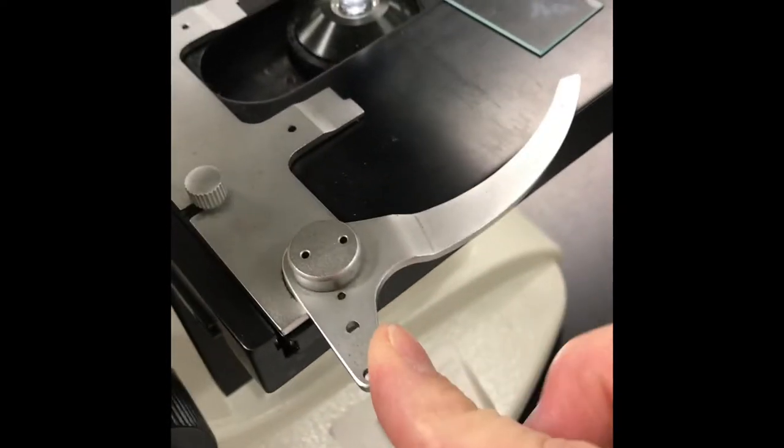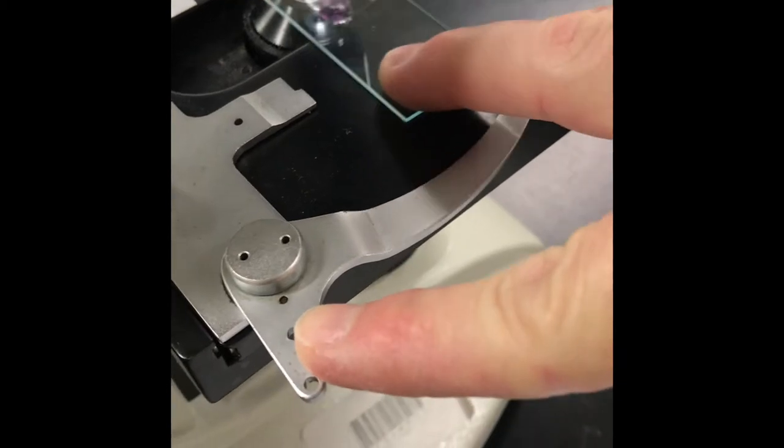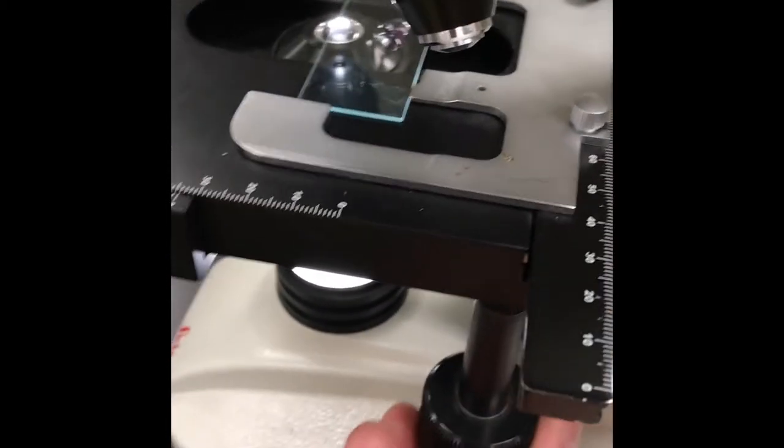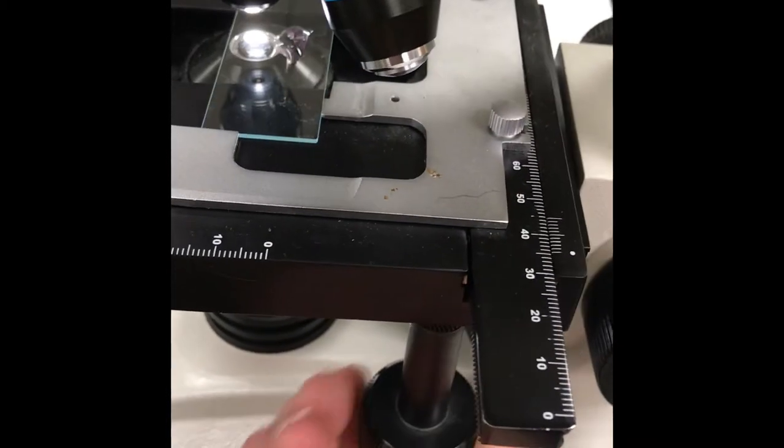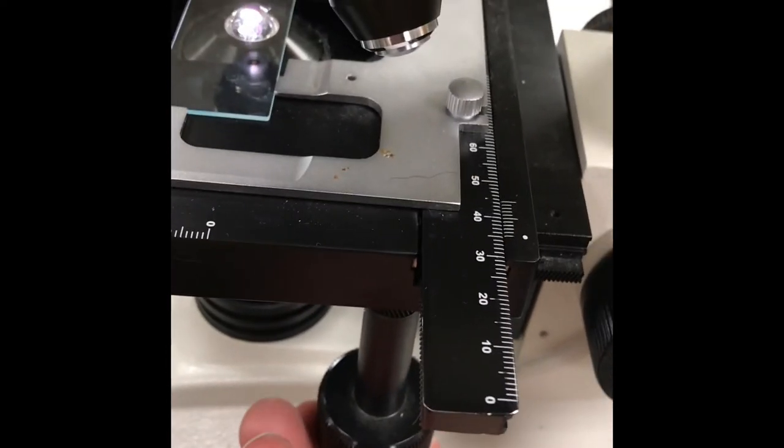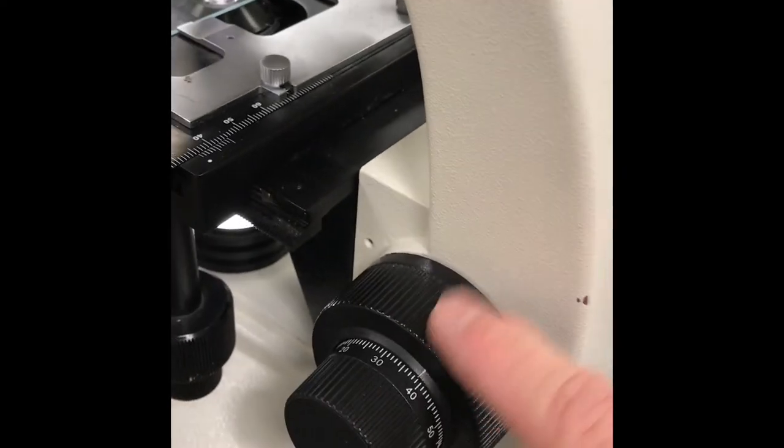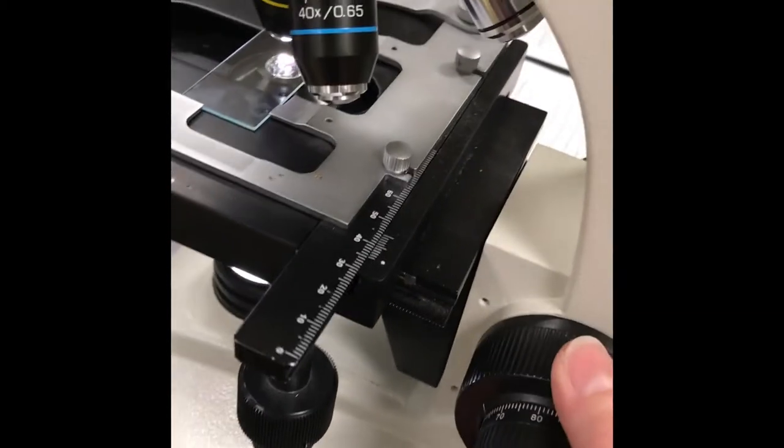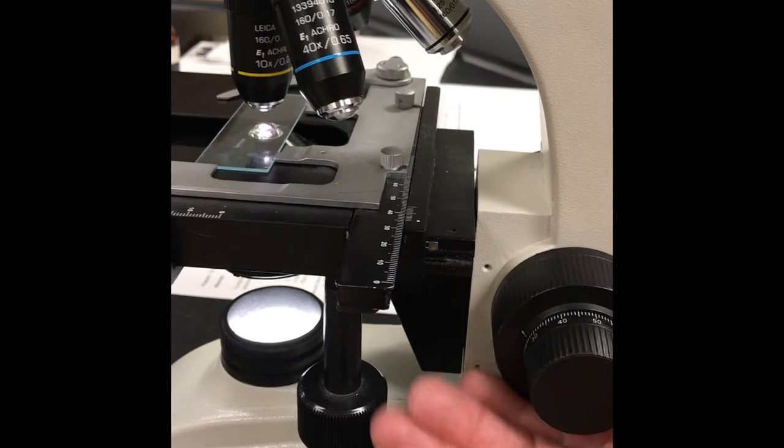Now without a cover slip, I'm going to focus this. I'll use the stage clip, pull that back, put the microscope slide on, and use the stage adjustment knobs right here to center it over the field of view. Now using the coarse adjustment knob, I'm going to look through the eyepiece and bring my stage up until I find something.